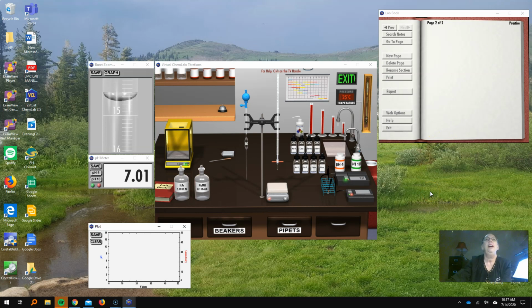Alright, so we're going to have a titrant, and we're going to have the titrant be a strong base, which is sodium hydroxide. So we're going to fill up this. This is the burette. Let me talk about everything we've got here. We've got to have a burette. We have a pipette. We have a pipette bulb that helps us fill the pipette. And we have the two things we're going to measure against. We have the sodium hydroxide, which is the strong base, and we have the weak acid, which is acetic acid. And then we're also going to put this indicator in there, bromocresol green.